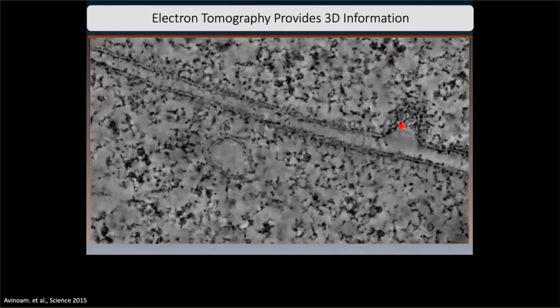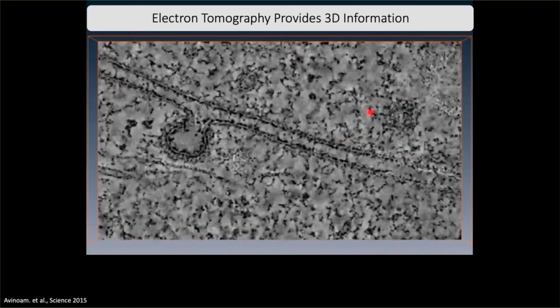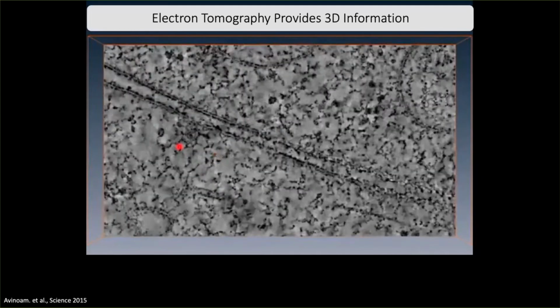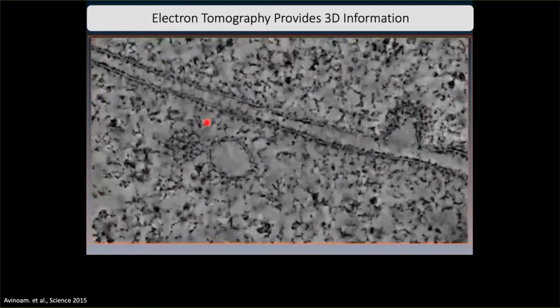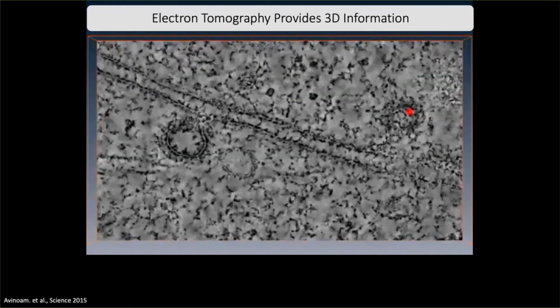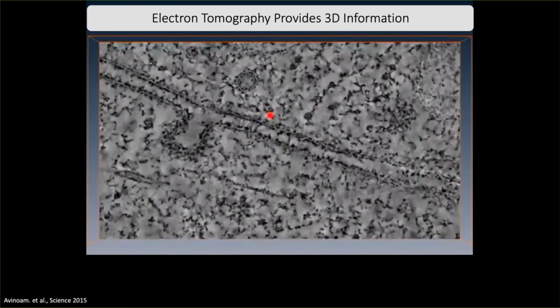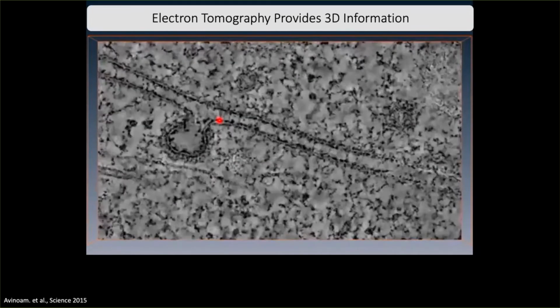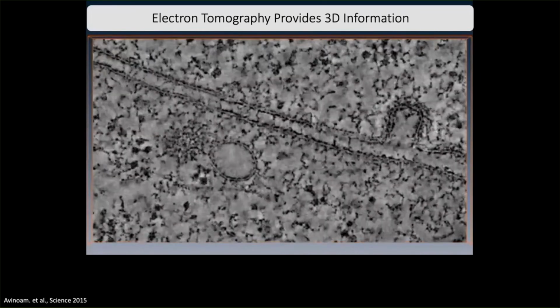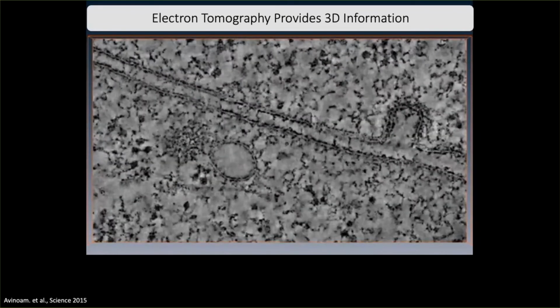And the fluorescent information tells me that on this side, there is, with high probability, one of the fluorophores. And on this side, there are two of them. And if you remember the kymograph I showed you, this makes total sense. This is sort of a U-shaped invagination of the membrane. And you see that the other object already has this curvature at the base, meaning this constriction that will eventually undergo fission, releasing the vesicle into the cytoplasm.